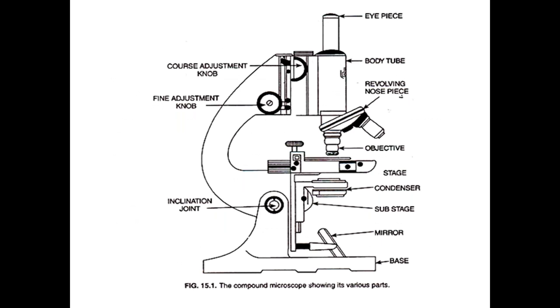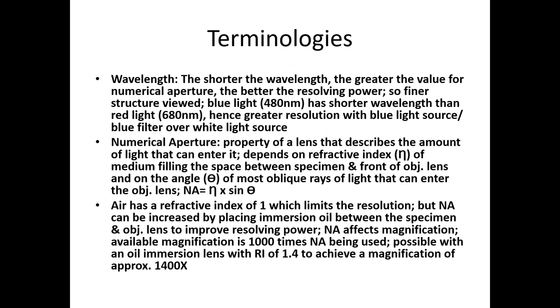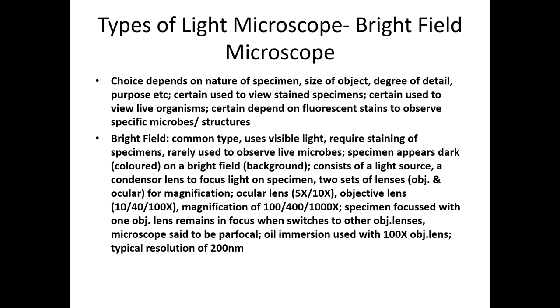For example, this is the basic structure of a bright field microscope. I have already discussed this. We will just see what the specialties of a bright field microscope are. But before going into the bright field microscope, first of all, the choice of a microscope depends upon certain factors.